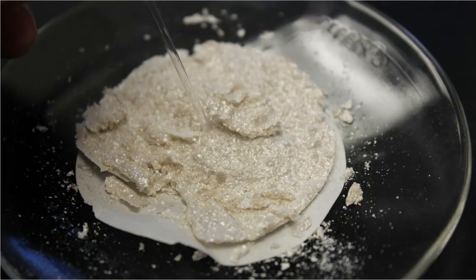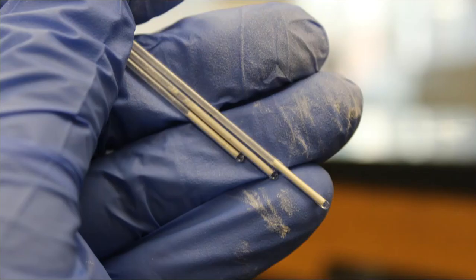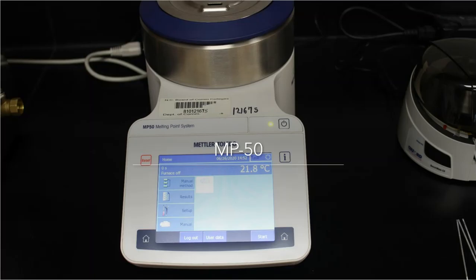All right, so here's just a close-up of the final product. Again, you can make your observations as you see fit. And here at the very top, you're seeing a capillary tube for a melting point test that we're getting ready to do. So I'm taking the melting point capillary and I'm crushing those crystals up, that way I can load these crystals up into a capillary tube. I use the tamping tool, T-A-M-P-I-N-G, a tamping tool to force all of that product down here in the very bottom of the melting point capillary. And I need to prep 3 of those. So there's the 3 that I've prepped, and I now need to take those to the MP50.